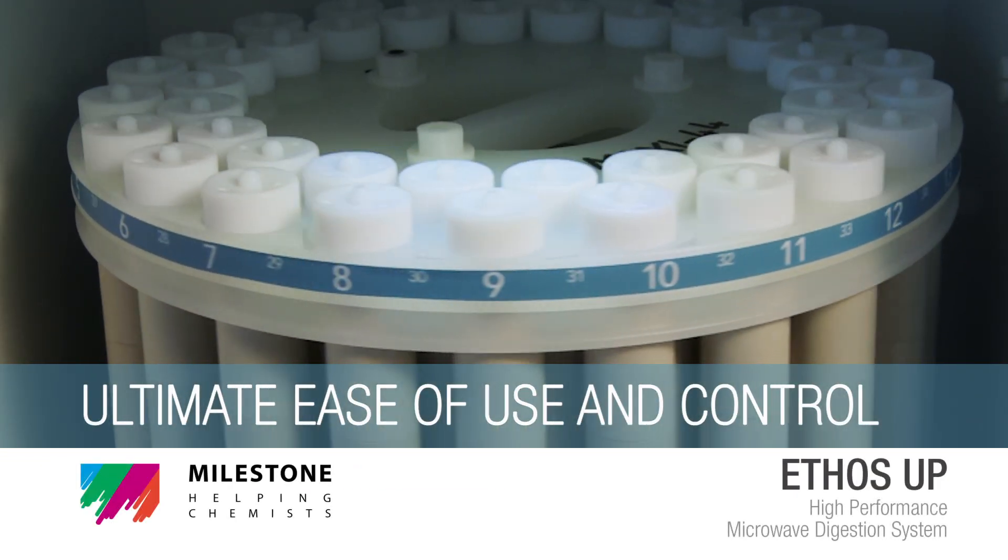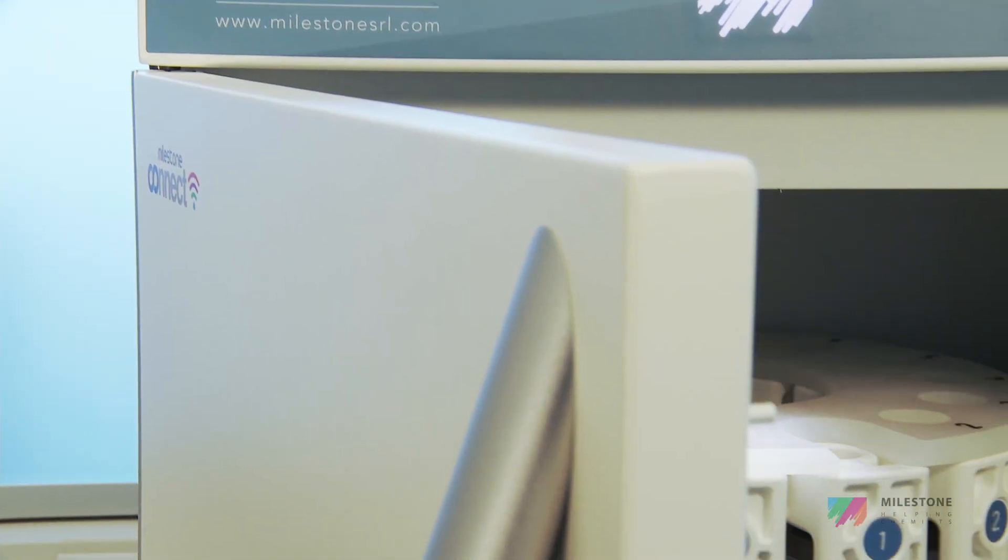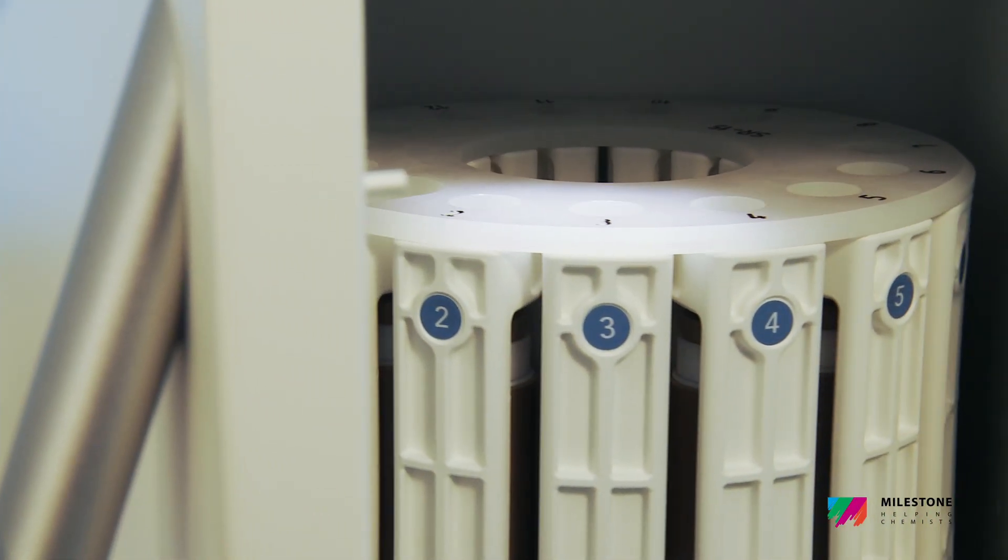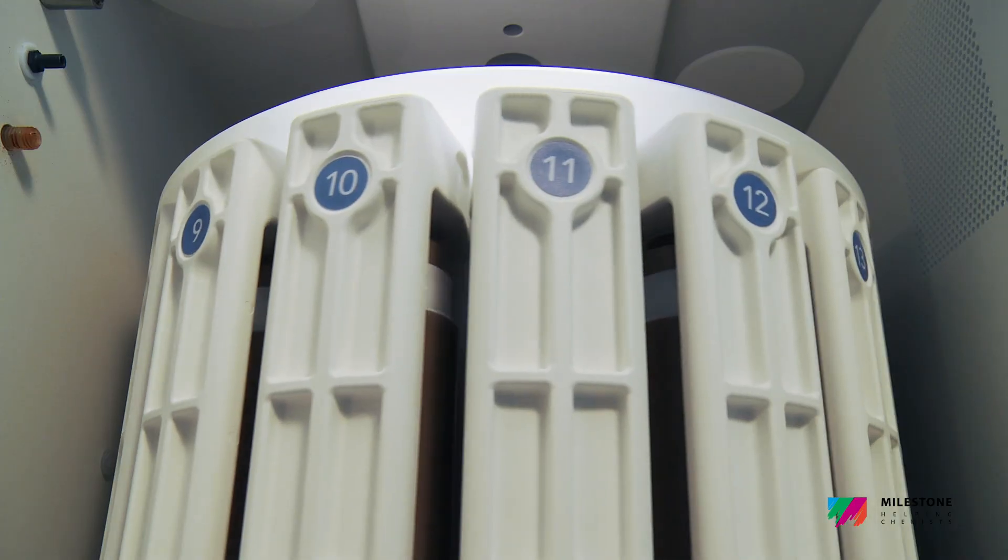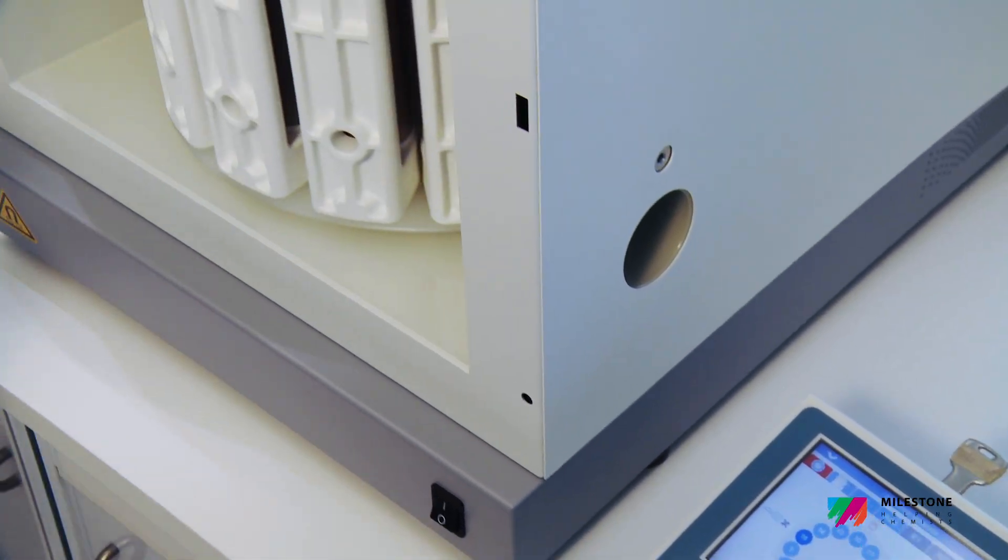Ultimate ease of use and control. Temperature is the most important parameter in a digestion process, as it controls the reaction and determines digestion quality.